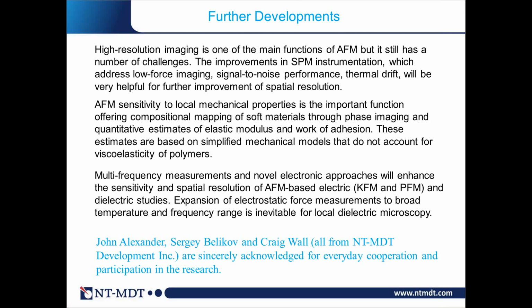But you see, this imaging with PeakForce QNM is not free from these challenges I described in the presentation. You need to know the tip radius and shape. You need to know the stiffness of that.